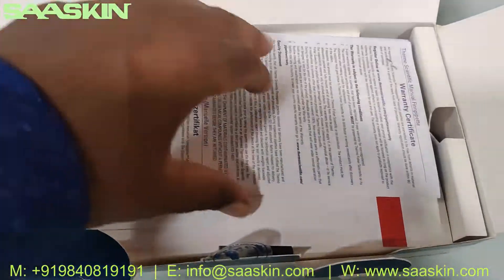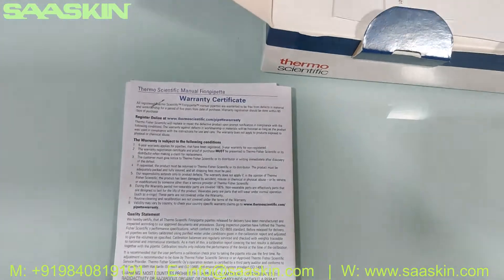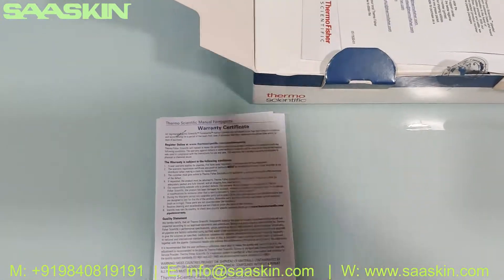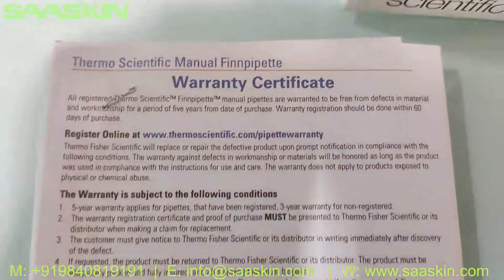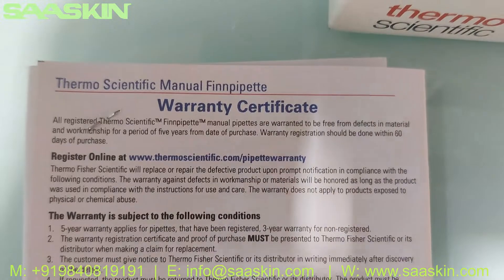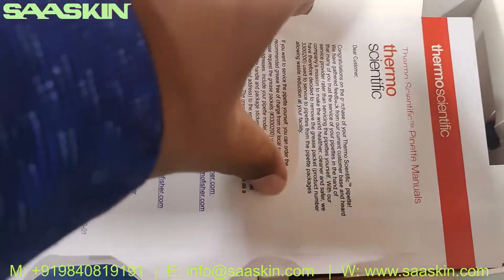In the top of the box, you have a warranty card. This is typically a three-year warranty, but when you register the product you get an extended warranty up to five years. This is the Thermo Scientific manual fine pipette multi-channel warranty certificate.